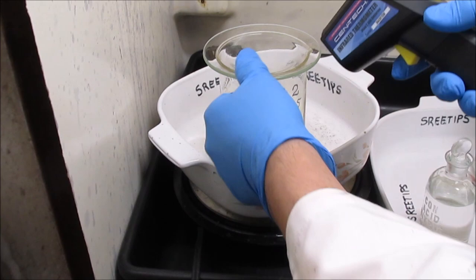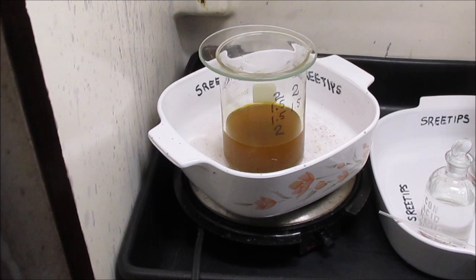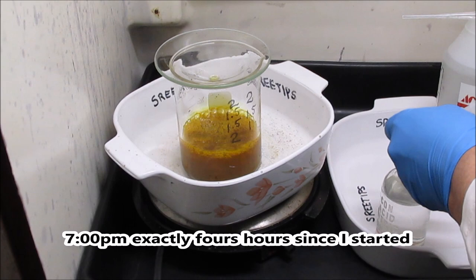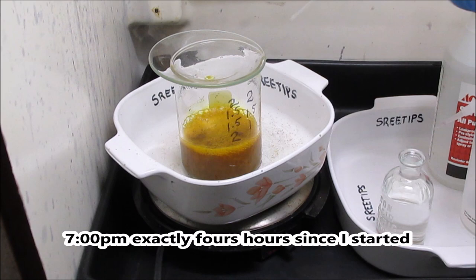Temperature in here is 152. What I'm going to do is turn the heat up a little bit over medium, and let this come up to temperature for about a half hour. I've had this on a little bit higher heat now for the last 20 minutes, and I'm going to add one drop of nitric here and see what happens. Absolutely nothing.